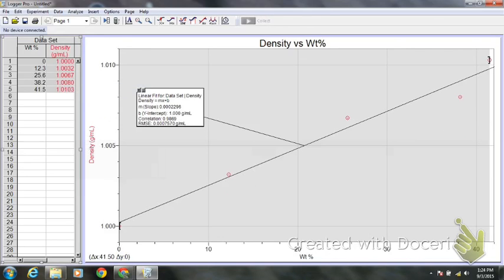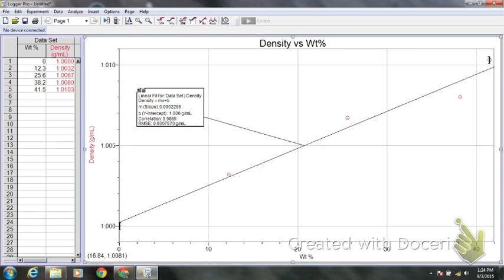Whew. Okay, now that looks good. So now you see the line's been drawn. The reason it's gray is because it's all selected. I can click somewhere else and it's going to go off of gray. So gray is okay. So this actually is what I'm looking for when you turn something in. This is what I'm looking for, exactly.